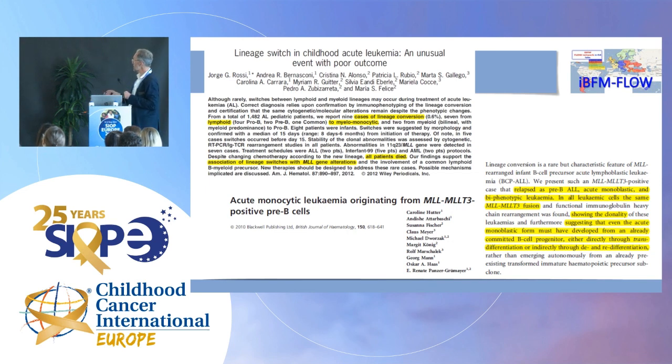But we also know, and this is also a paper, and the first author is also in the room. Hello. That you can have those switches as in the relapse. So not early, but later on. And in MLL situation, they can switch from ALL to AML to ALL to AML. This also happens. And this also occurs after CAR cell therapy, we have heard.